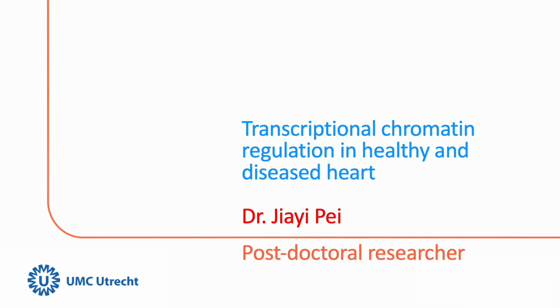We are happy to present our work on transcriptional chromatin regulation in healthy and diseased heart. Chromatin is a complex of DNA and proteins whose accessibility changes in response to disease etiology or other stimuli. Therefore, chromatin plays a critical role in regulating biological processes.